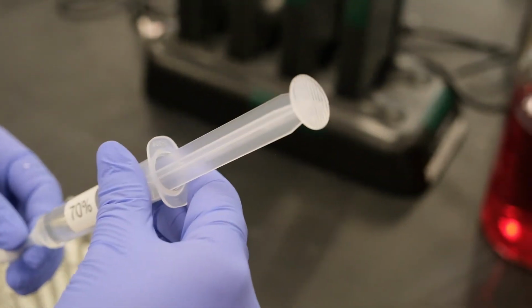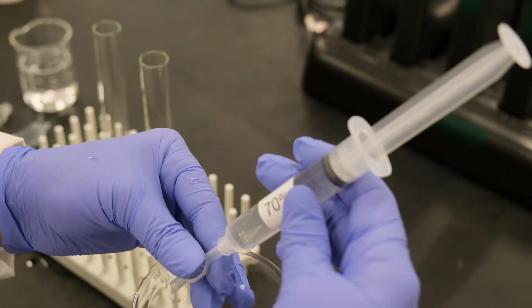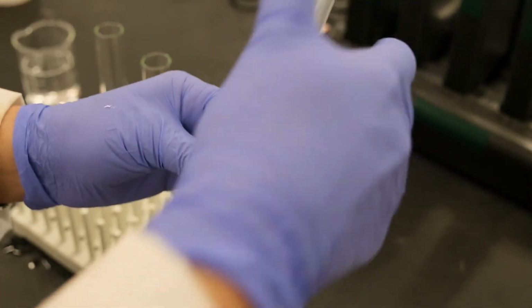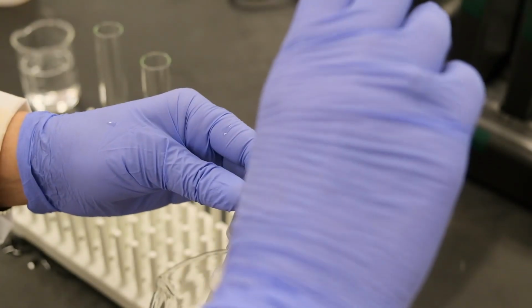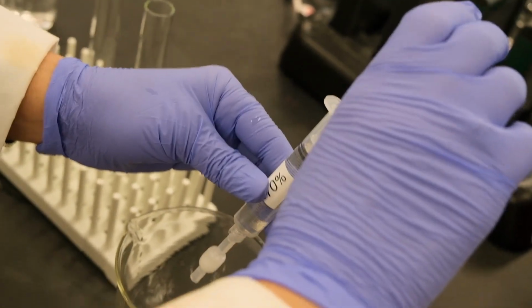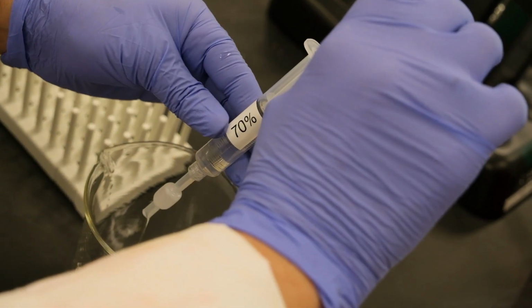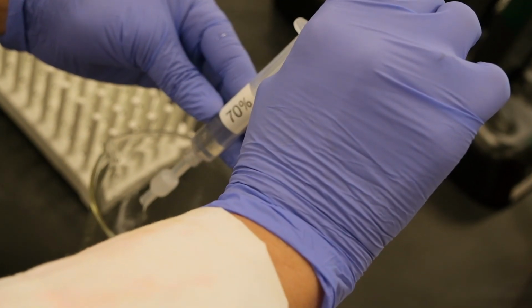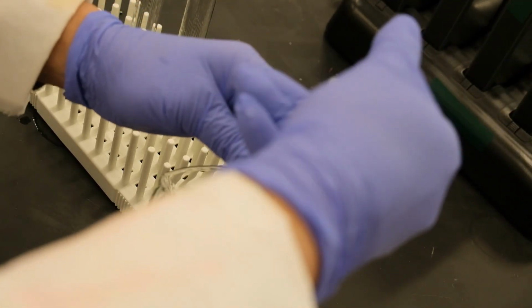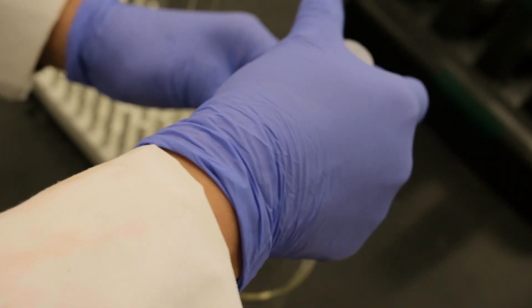The first thing we do is we clean our cartridge with 70% isopropyl alcohol. So this is our waste container, and we push through our cartridge the 70% solution.